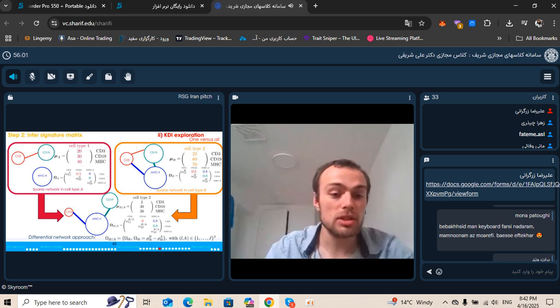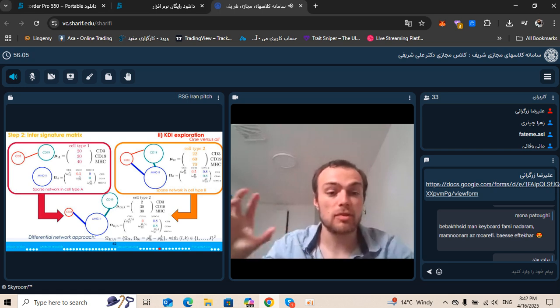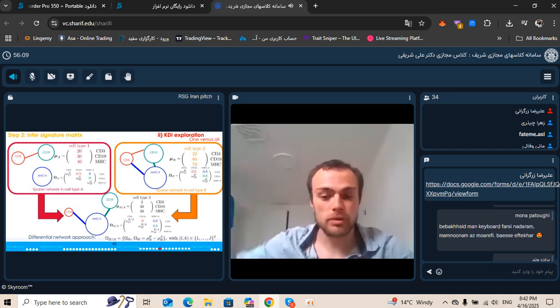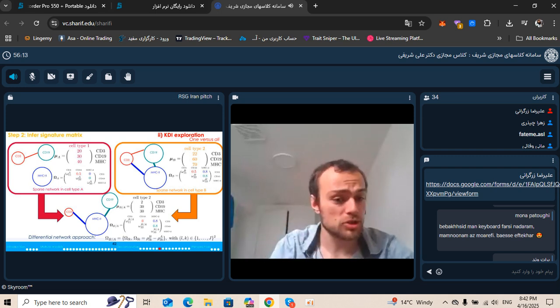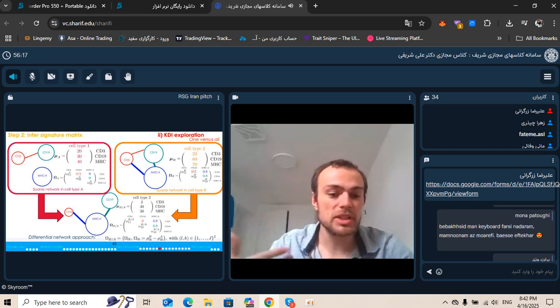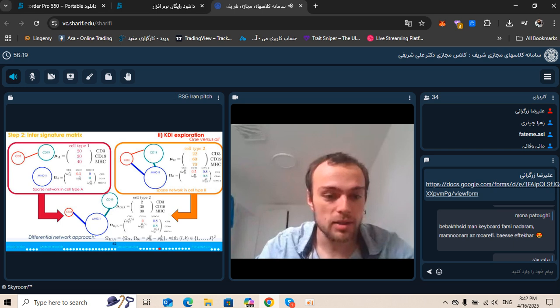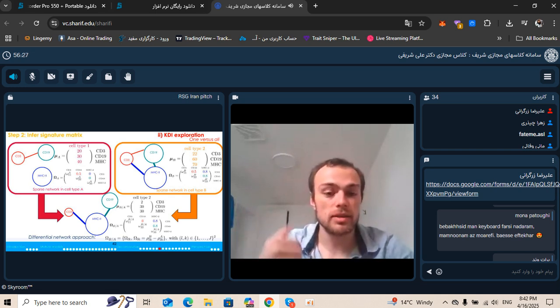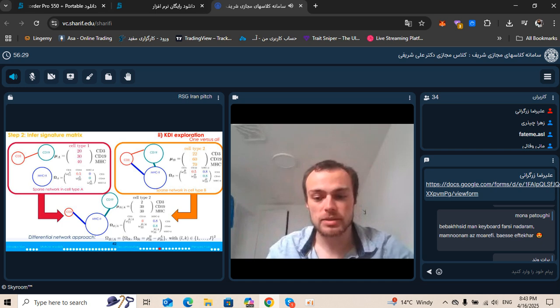You're going to do it in 2 stages. The first stage, you're going to identify the subset of markers specific to a given cell population with respect to all others. Secondly, remember that we are considering not only the mean expression profiles, but also the network expression. And so this is something that I would like to incorporate when selecting my markers. And one way of doing so is to rely on a general family of approaches called differential network approaches.